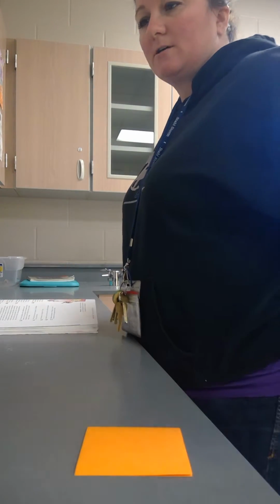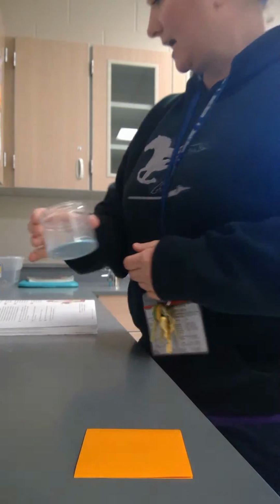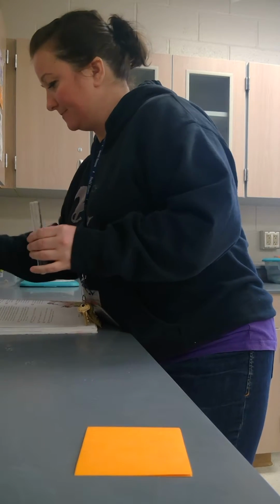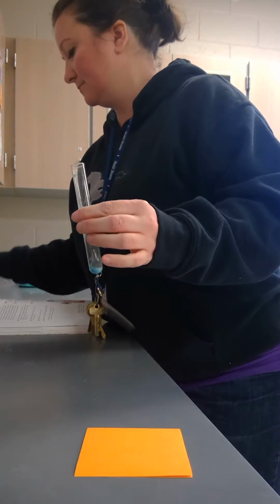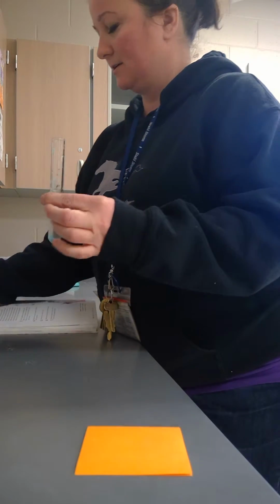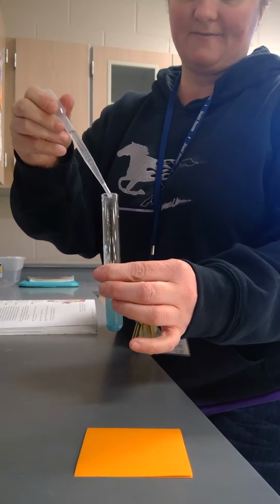And now I'm going to move on to what's called copper sulfate. So you can see here, this is blue in color. Kind of a pretty blue, kind of a tealy blue. Again, same exact procedure, 1 scoop. So I place that 1 scoop inside here. I measure to where the 5 centimeter mark is, hold it there with my thumb, and now I go ahead and I add in my water up to where my thumb is holding that 5 centimeter mark.